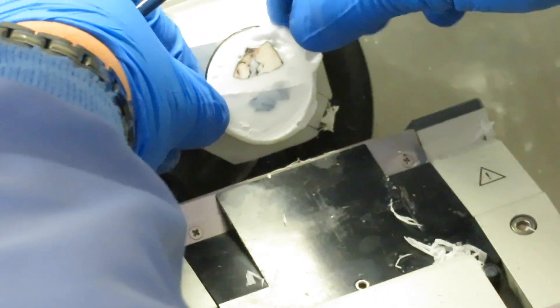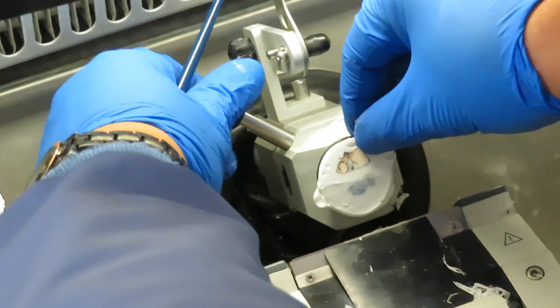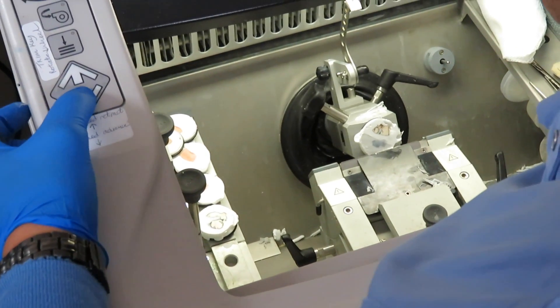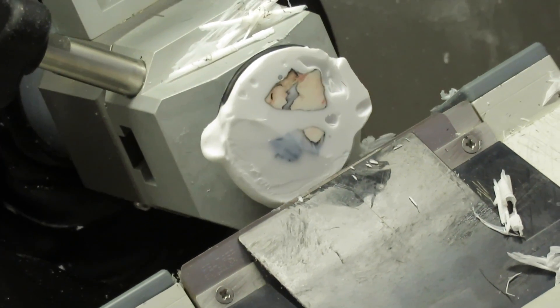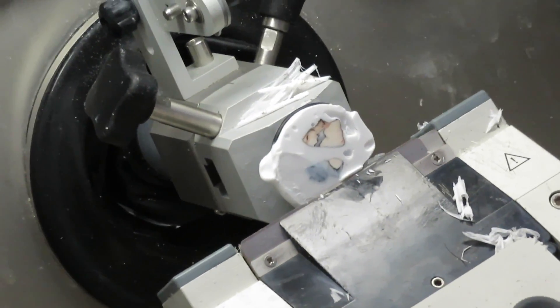If both tissue specimens aren't on the same plane, the best thing is to rotate it and angle it with the handles. Then it'll start cutting through the other tissue we need. He's starting to cut into that second tissue, but we need the full cross-section of that.